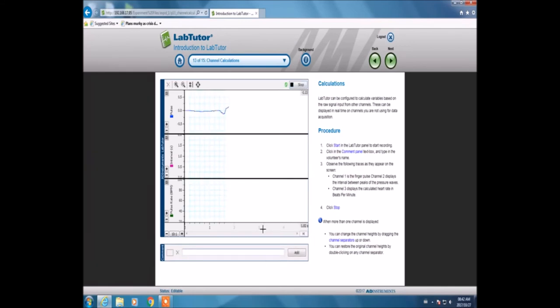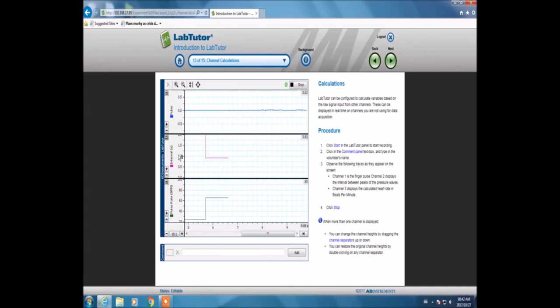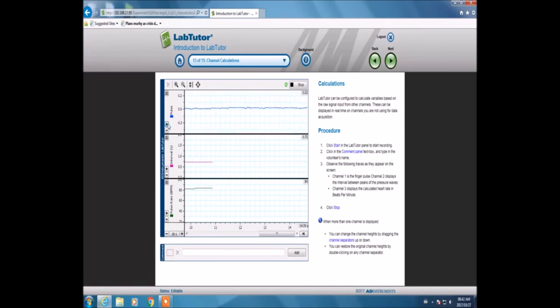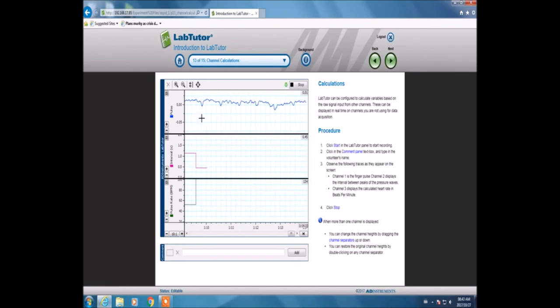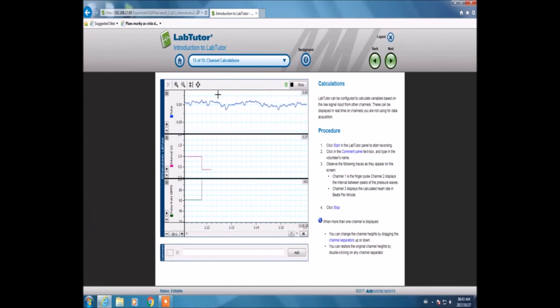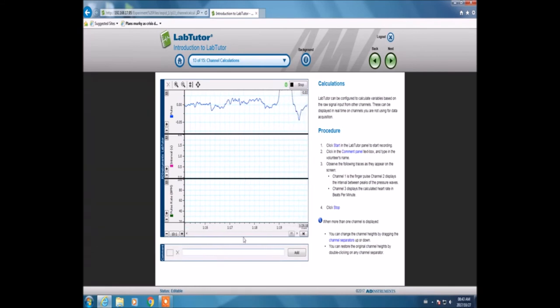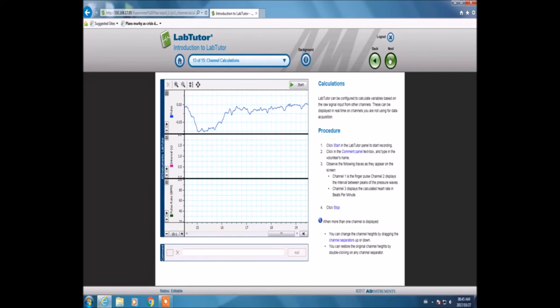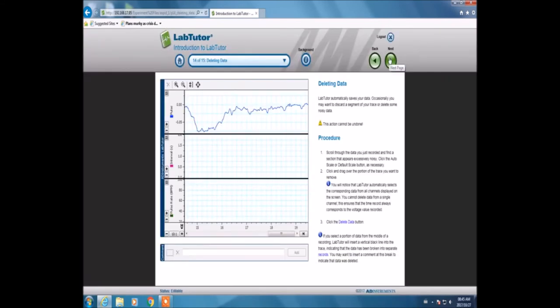The next part is to run three graphs at once: pulse, pulse interval, and pulse rate. It's very important to make sure your information is on the right scale so you can observe readings from all three graphs. It might be necessary to make some adjustments to the graphs in order to obtain better readings.